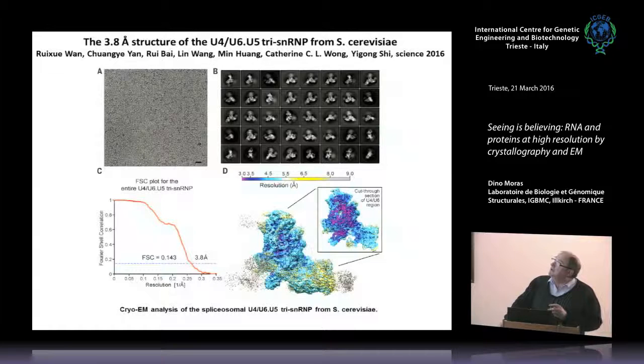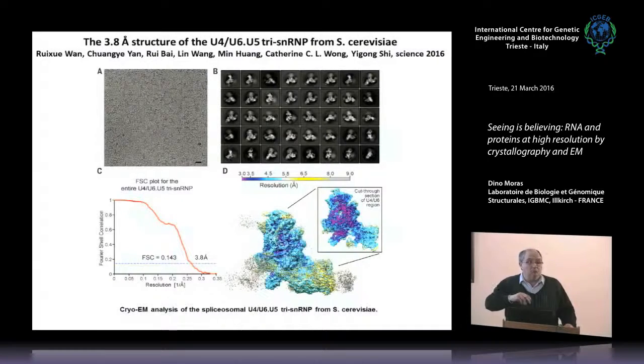And here you have an example, 3.8. We'll give you three structures. It's amazing. More than 20 years of work, close to 30 years, I would say, from the beginning. You will see one of the founders of that approach, Luhrmann, who worked on the human one. He's part of that team. That was 30 years ago, I would say, roughly the beginning. And last January, three structures.